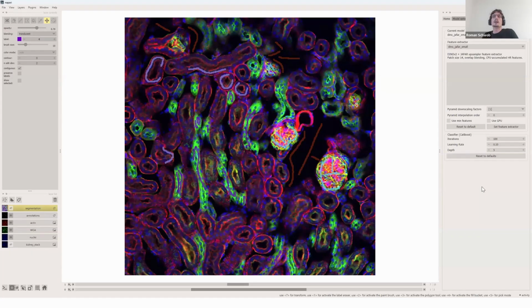And I'd rather show you a little example now, and probably you don't have the system set up to follow along with this, so maybe just observe what I'm doing. Those are the major things that I wanted to show you about Convpaint.